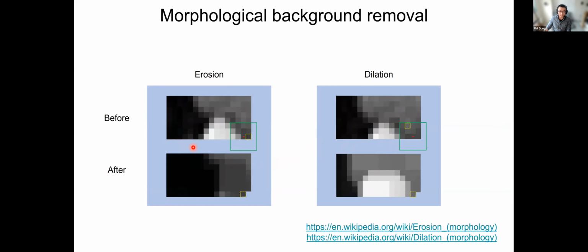On the other hand, when you use a kernel size that's too large, you can see that it left out a lot of local background even after this step, which is not what you want, because the goal of this step is to remove background. So again, we want to avoid both extreme cases, and we want to use a window size that's in between. And this visualization helps you to do that.